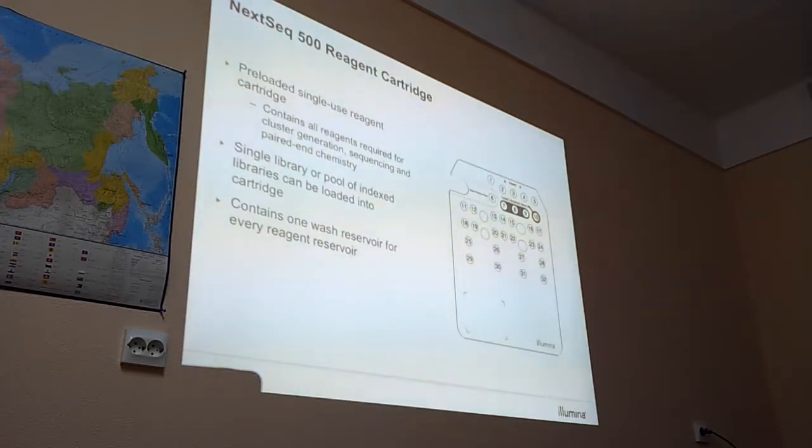Then the cartridge in more detail. Similar to NextSeq, you use it only one time. Here the position 10 is for the library, so always orange. So even after some vodka, you will find it. Then numbers 7, 8, and 9 are for custom primers. Normally you don't need them. Only if you have a custom recipe with your own indices would you need them.